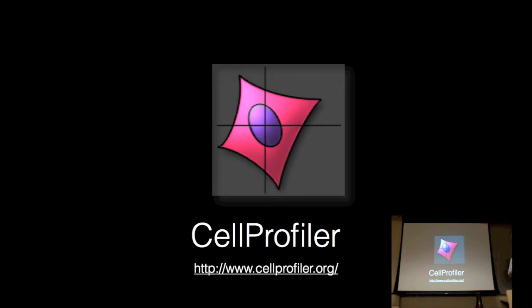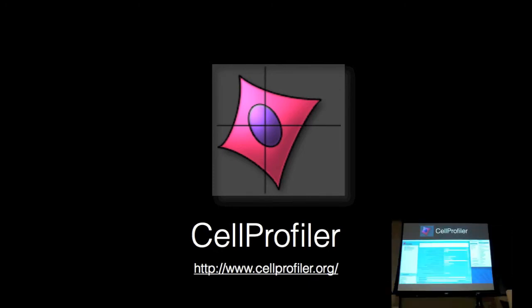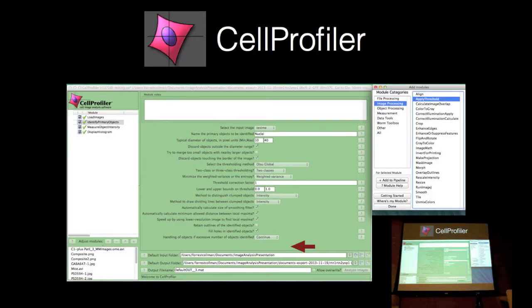The final thing I'm going to talk about is Cell Profiler. Cell Profiler is, again, another open source Python-based program. And the great thing about Cell Profiler is it's really set up from its foundation to be an image pipeline. So it's not a do-this-thing-once kind of tool. Rather, you set up a set of things that it's going to do to any image or all the images in a folder, and if you get it working for one, you can then apply it to all the rest of your data.